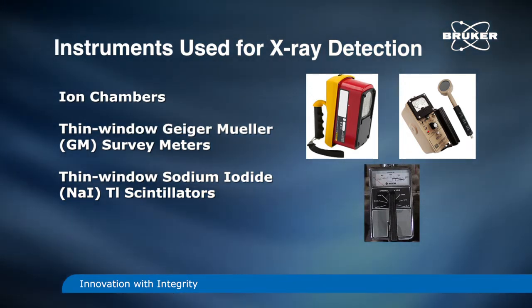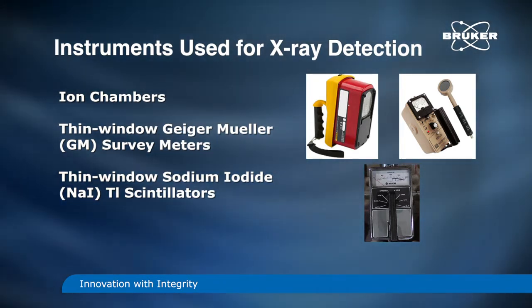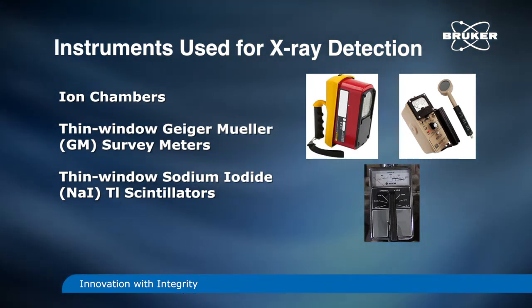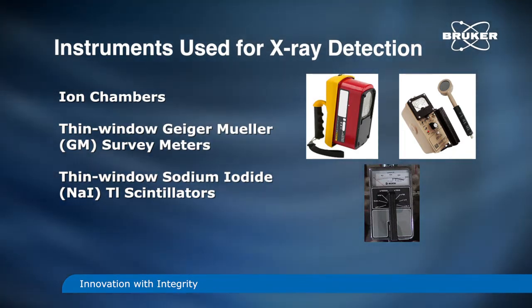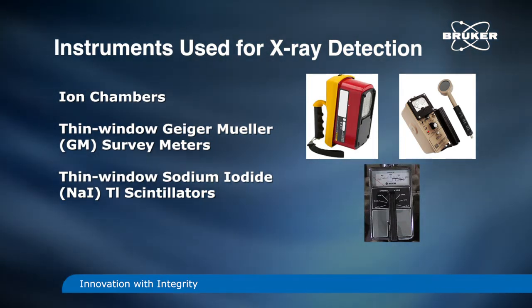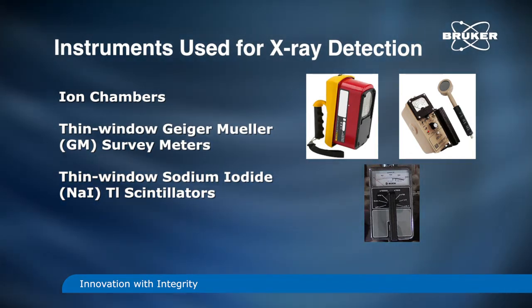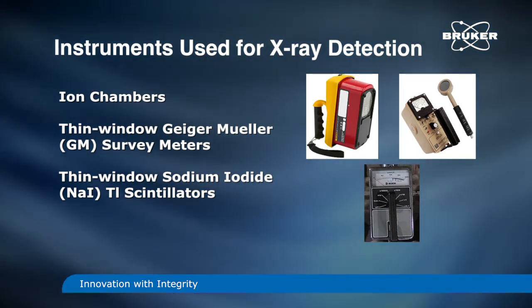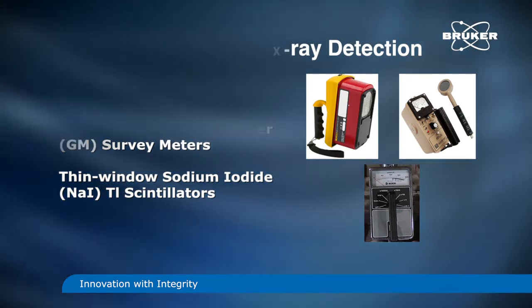The GM meter has excellent sensitivity for detecting low levels of radiation. Unless the meter has been calibrated for the radiation energies expected, GM meters should be restricted to the detection of radiation only, rather than the quantitative assessment of a dose rate. The ion chamber survey meter is preferred for measuring the amount of radiation emitted, principally because of its accuracy. Equipment manufacturers can be helpful in choosing the correct meter. Be as specific and detailed as possible about the radiation type and your intended use of the meter.